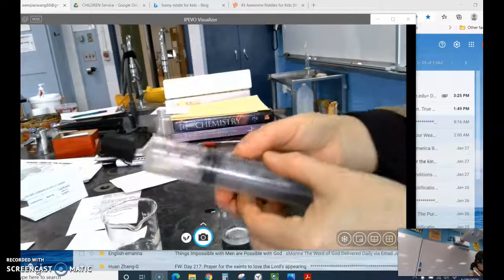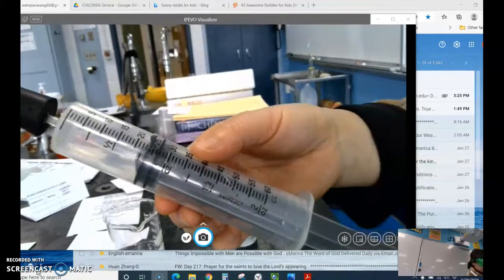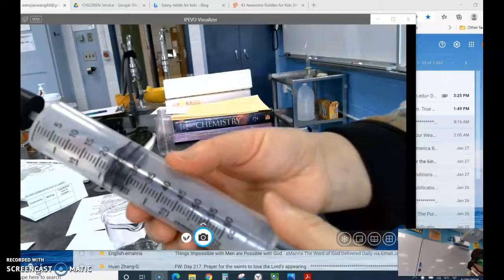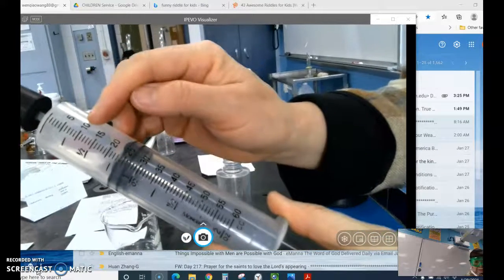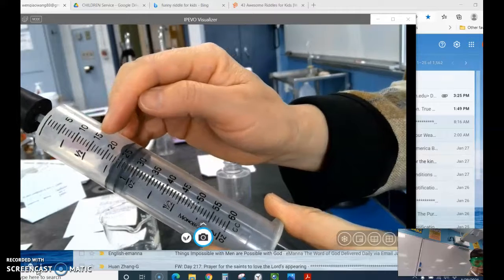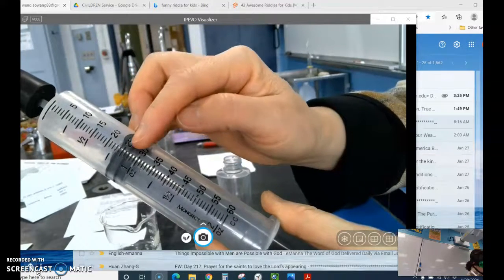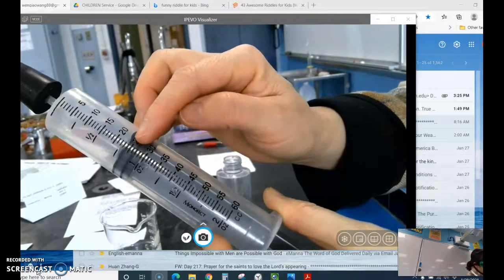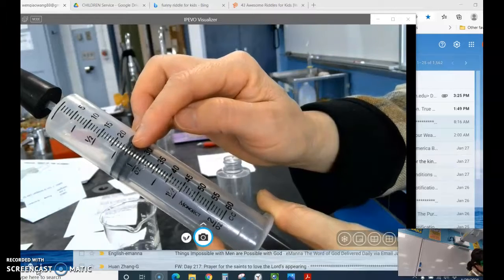Okay. So let's bring this one closer for you to see. Focus on this thing. Okay, so hope you can see this one. So right now what you look at is 5, 10, 15, 20. So this part is 25. So you can see my line is not at 25 yet. So the line here is actually 24.